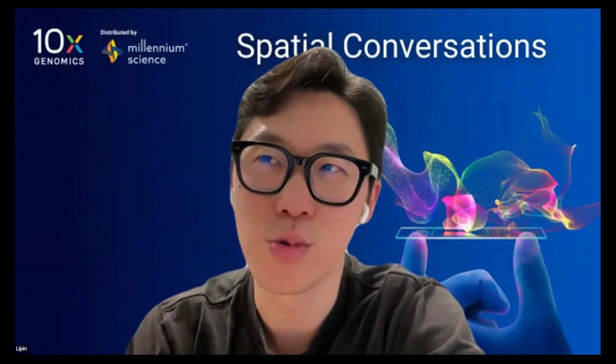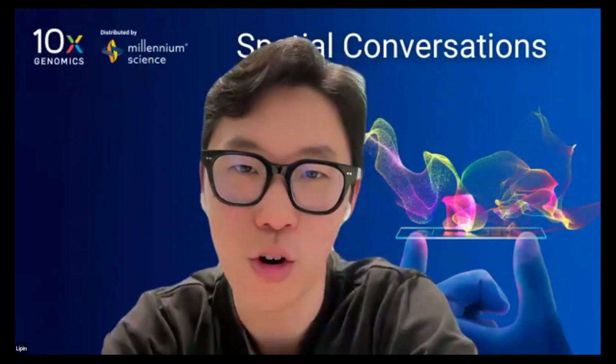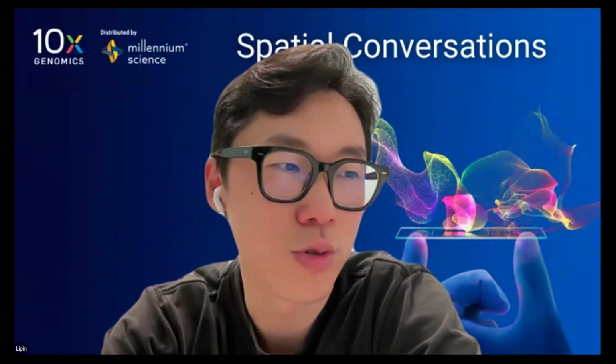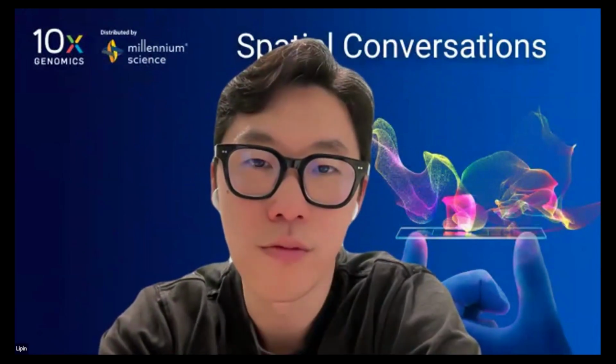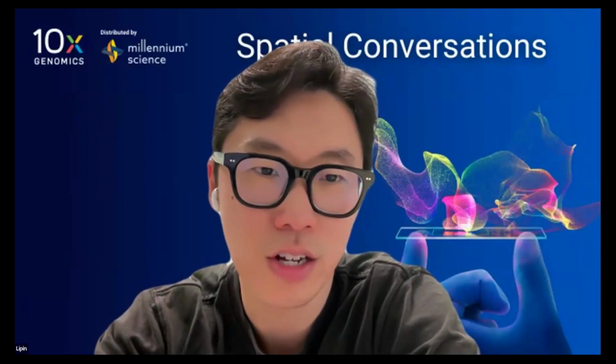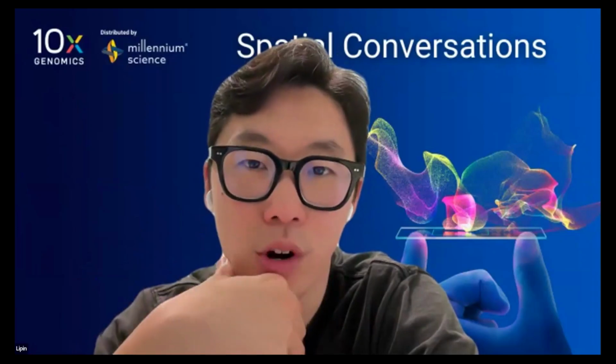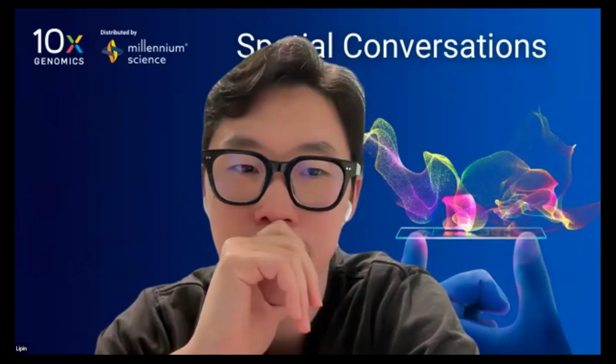There are a few things we would need to adjust for, like if you want certain plots for features or clusters, but it'd be great if we got all of that built into it. And I don't see why that would be too hard, because a lot of the pipeline already does clustering, k-means or graph-based clustering, and just incorporating some of Seurat's workflow into it should be quite easy.